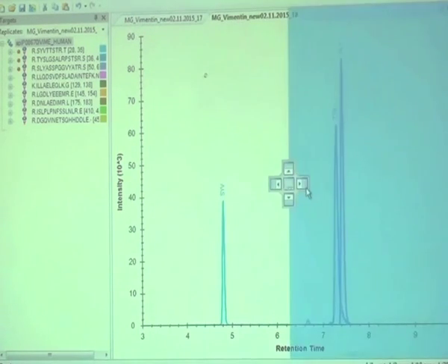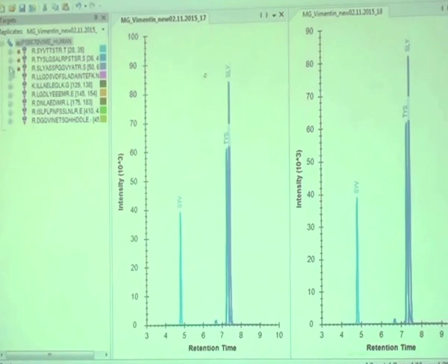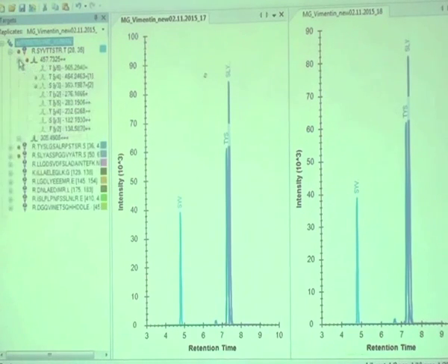So, you can just adjust the data files, and here you can see in the remaining peptides there is no response generated. Only for these 3 peptides there is response generated. But still they are looking red because for some of the transitions there will not be any response.